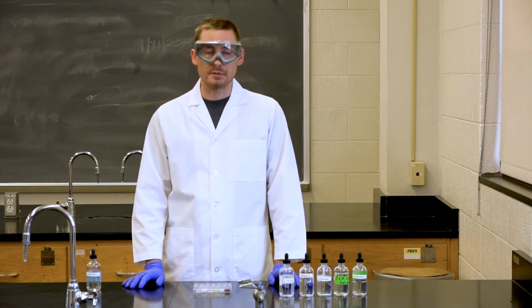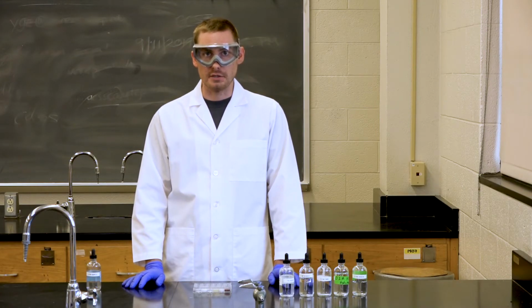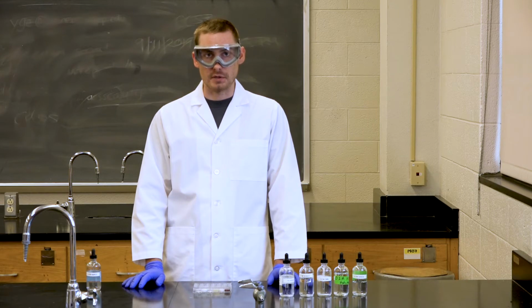Make sure you write down your observations in the chart on page 268 in your lab book. It will help you later identify which ions are in which mixtures as we do the second part of the experiment.